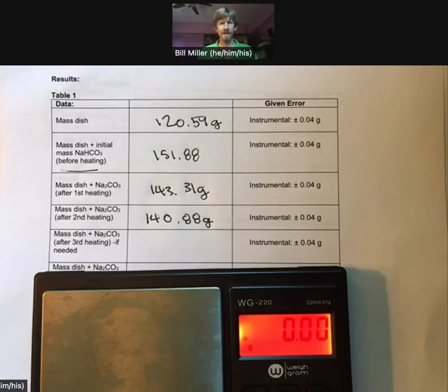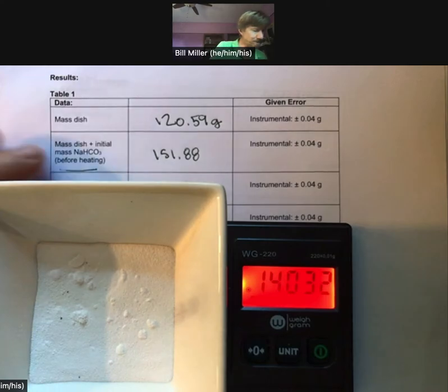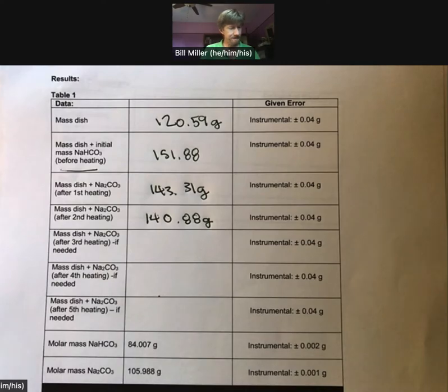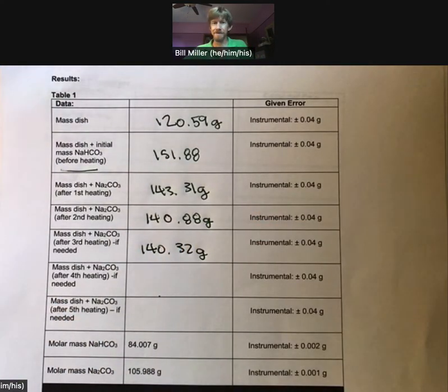Well, here we go again. Let's see if we've reached steady constant weight, constant mass. I heated it again for 30 minutes. I actually let it cool for 40 minutes because I was busy doing other things. So it is still decreasing. I don't know if you can see that number there, 140.32. Write it down, heat it again. All right, see you in a little bit.